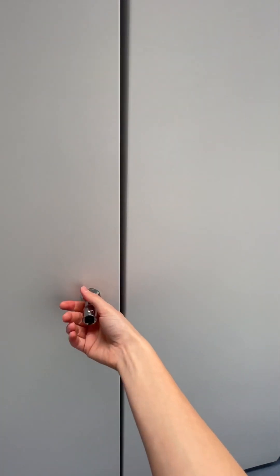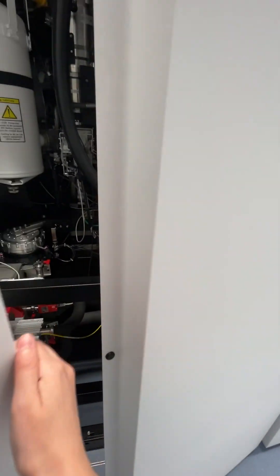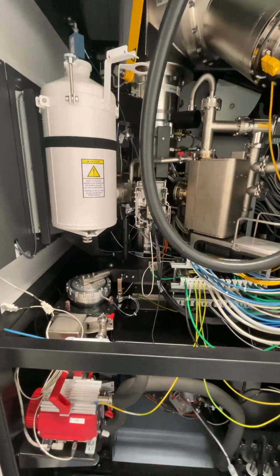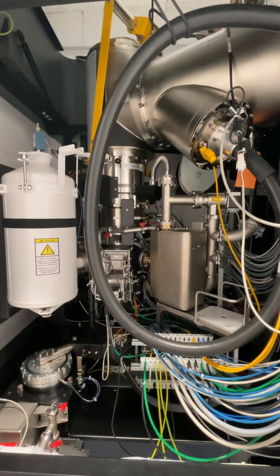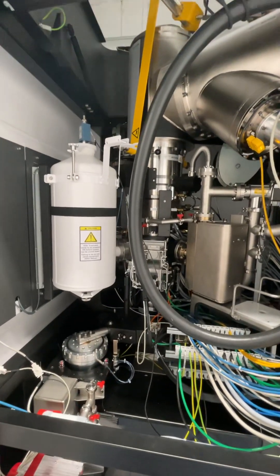Let's look at it though — I'll open this side. Again, users won't need to come over here. If you've used a TEM before, this is more what you're used to seeing — maybe with a little more of a housing unit, but lots of wires and components visible.